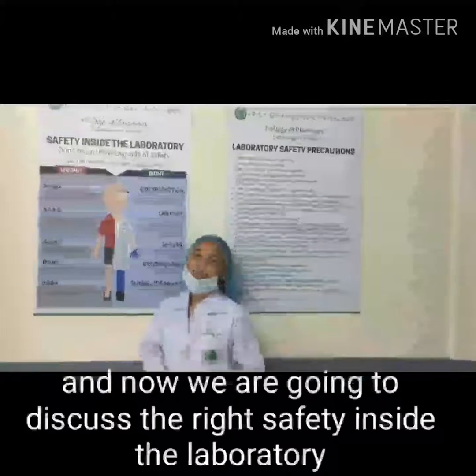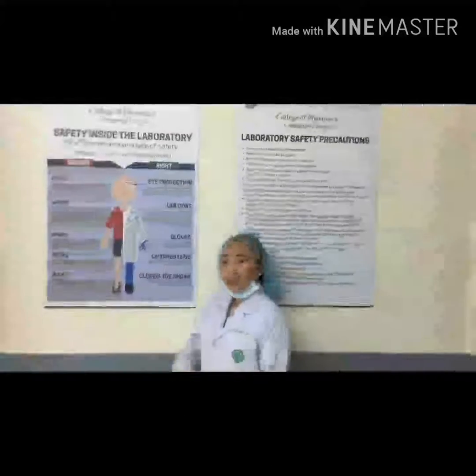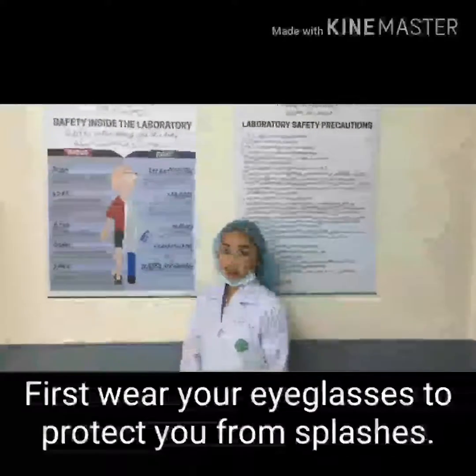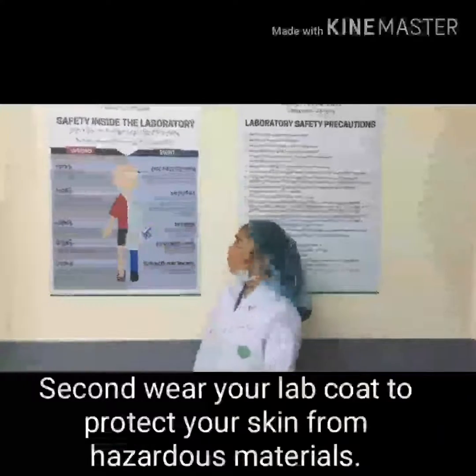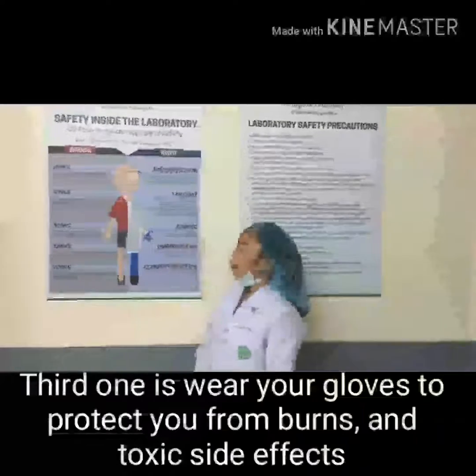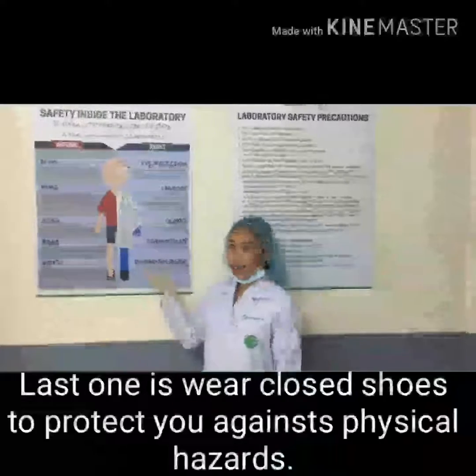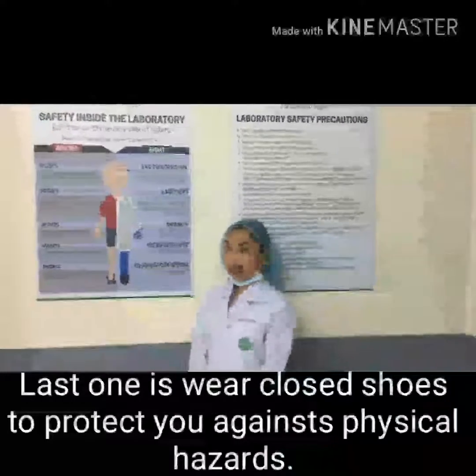Good day Pharmazish! And now we are going to discuss the right safety inside the laboratory. First, wear your eye glasses to protect you from splashes. Second, wear your dunk coat to protect your skin from hazardous materials. Third, wear your gloves to protect you against burns and toxic side effects. Last one is wear your closed-toe shoes to protect you against physical hazards.